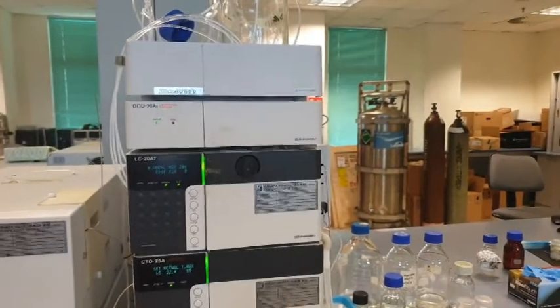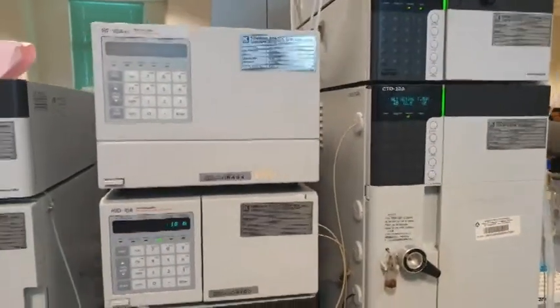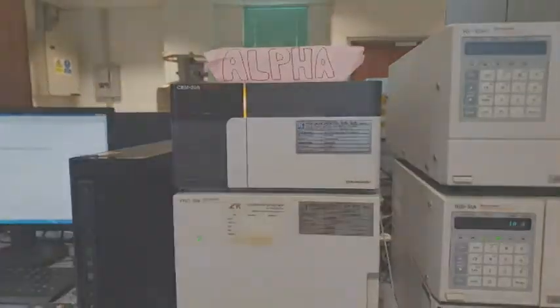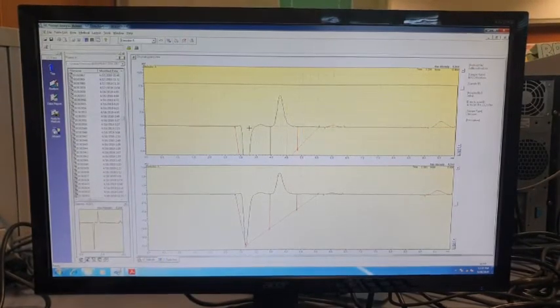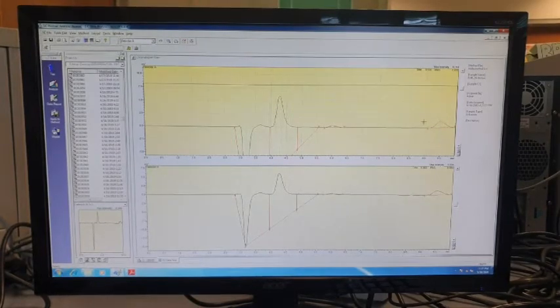This is the high performance liquid chromatography machine, also known as the HPLC machine. By using this machine, we can analyze the glucose and ethanol content in our samples. Samples that are about to be analyzed must be filter-sterilized to avoid contamination and large particles that can interfere with the analysis. Compound peaks will be generated to show the components present in the sample. For our experiment, glucose falls at the minute of 4.3, whereas the ethanol peak is at 9.6 minutes.